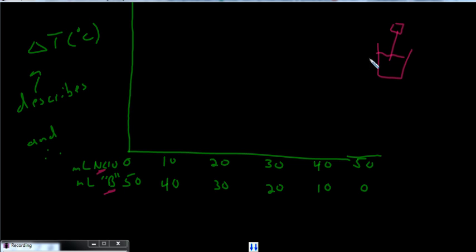You're going to be keeping track of the temperature of the water versus the ratio of these 2 things. Now, you should get data which may look something like this. And where those lines intersect, that will again describe the ideal ratio, i.e. describing the coefficients in the reaction between sodium hypochlorite and B.